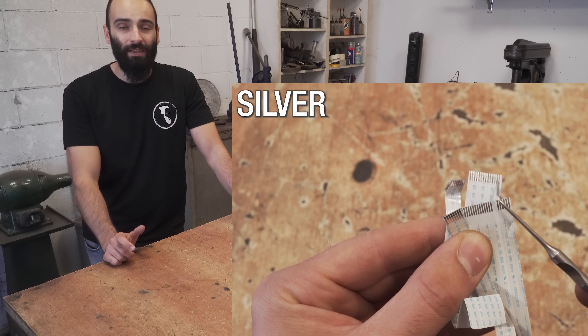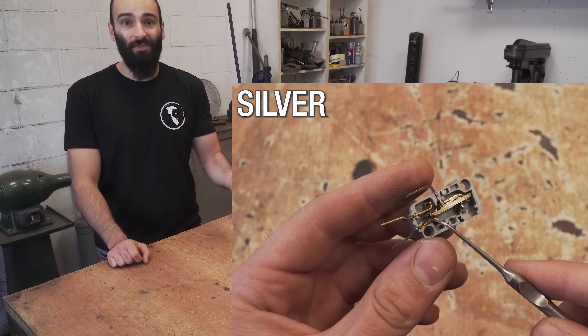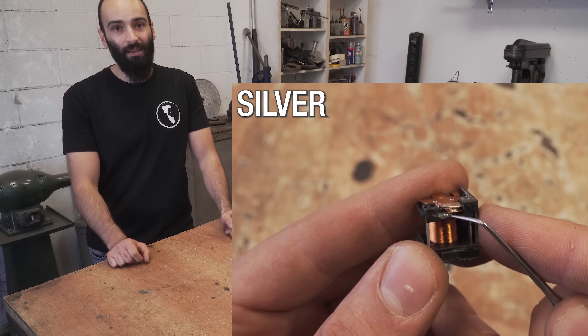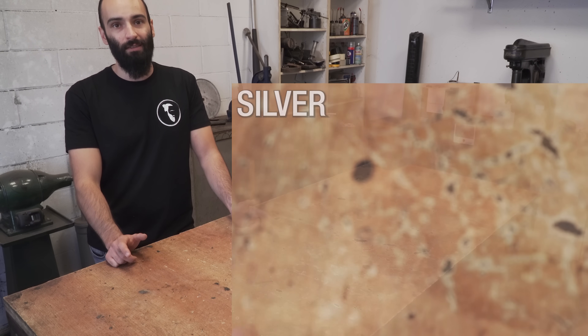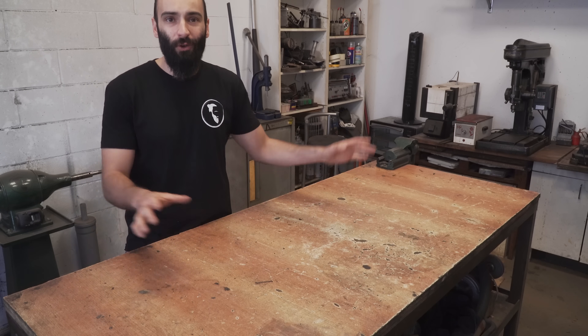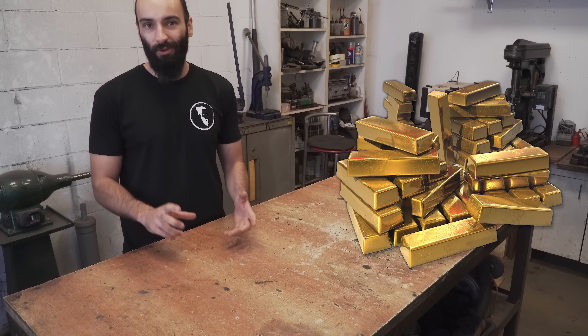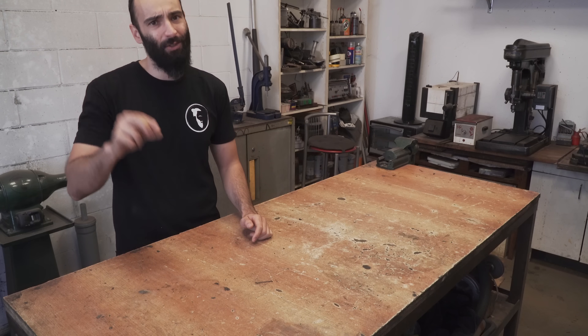All electronics are made with traces of precious metals like gold and silver, often in the form of plating, to take advantage of the incredible corrosion resistance and high electrical conductivity of those precious metals. And today I want to take all those traces and turn them into a solid bar, or most probably like a little nugget.